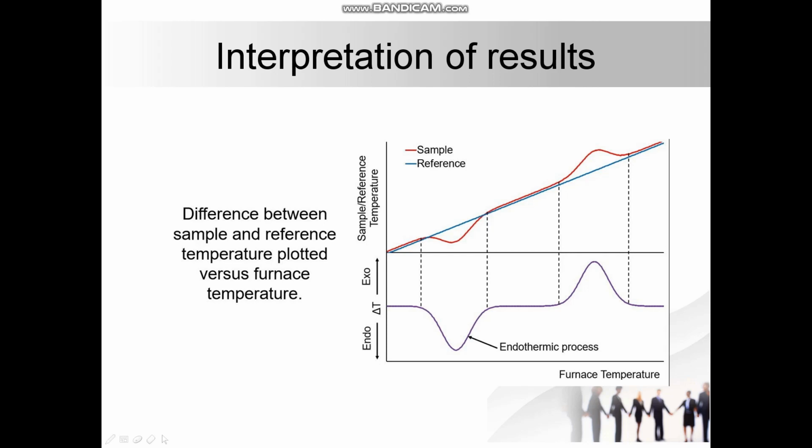So it means that the heat that was being supplied was not used to raise the temperature of the sample. It would be used for changing either the phase of the sample, or it is heat which is used in another endothermic process.